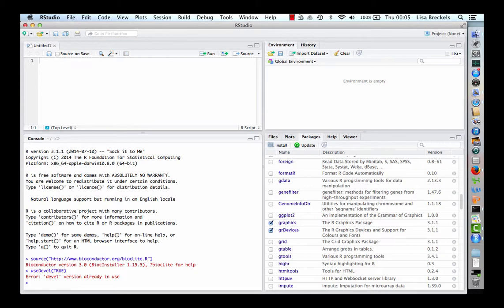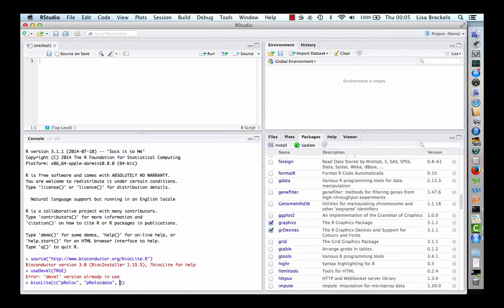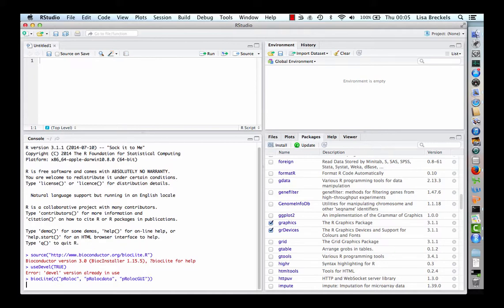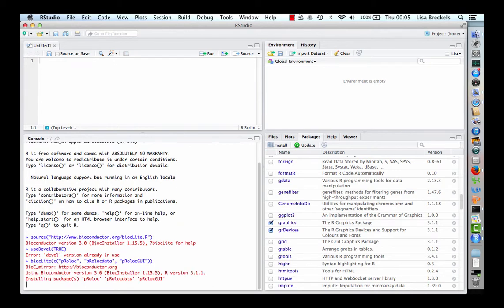Now, to install the packages ProLock, ProLock data and ProLock GUI, simply type bioclite and then the list of the packages you wish to install. ProLock, ProLock data, ProLock GUI. This may take a few minutes.